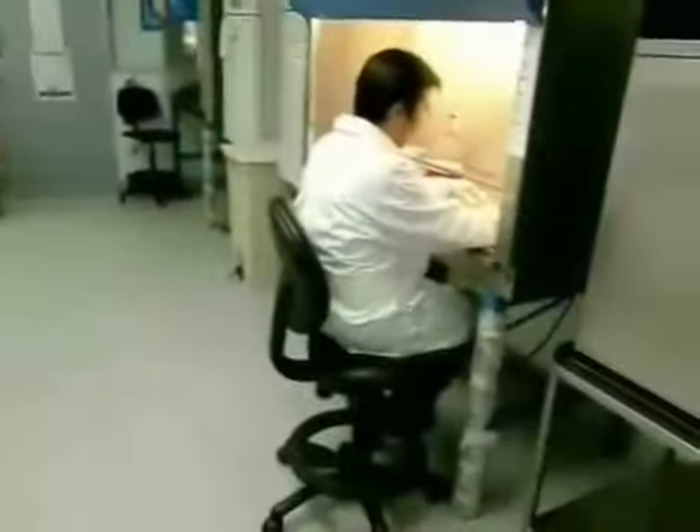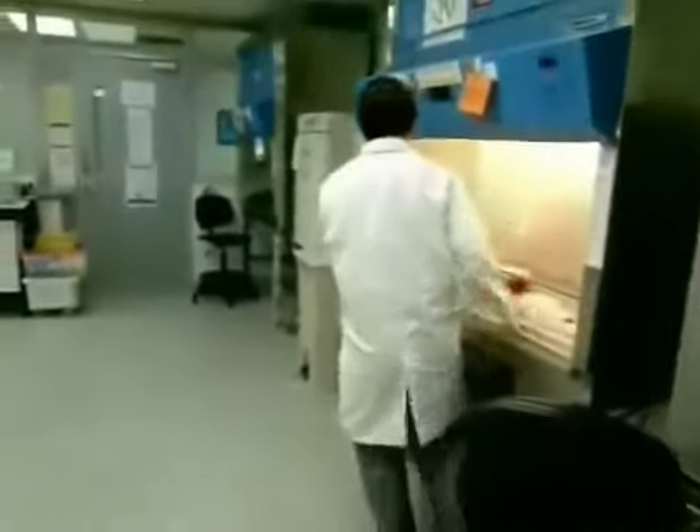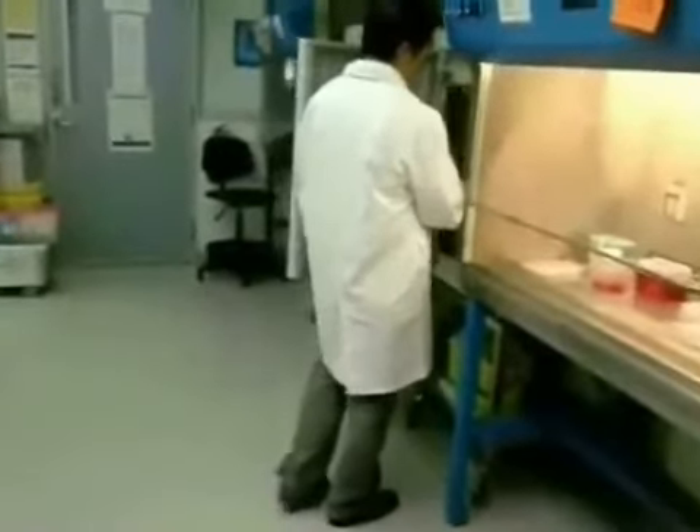Oh ho, I spilled my virus samples while doing an experiment. I've attempted a clean-up. Could you check if I've done the correct procedure? Oh sure, Michael. Let's go through what you did.